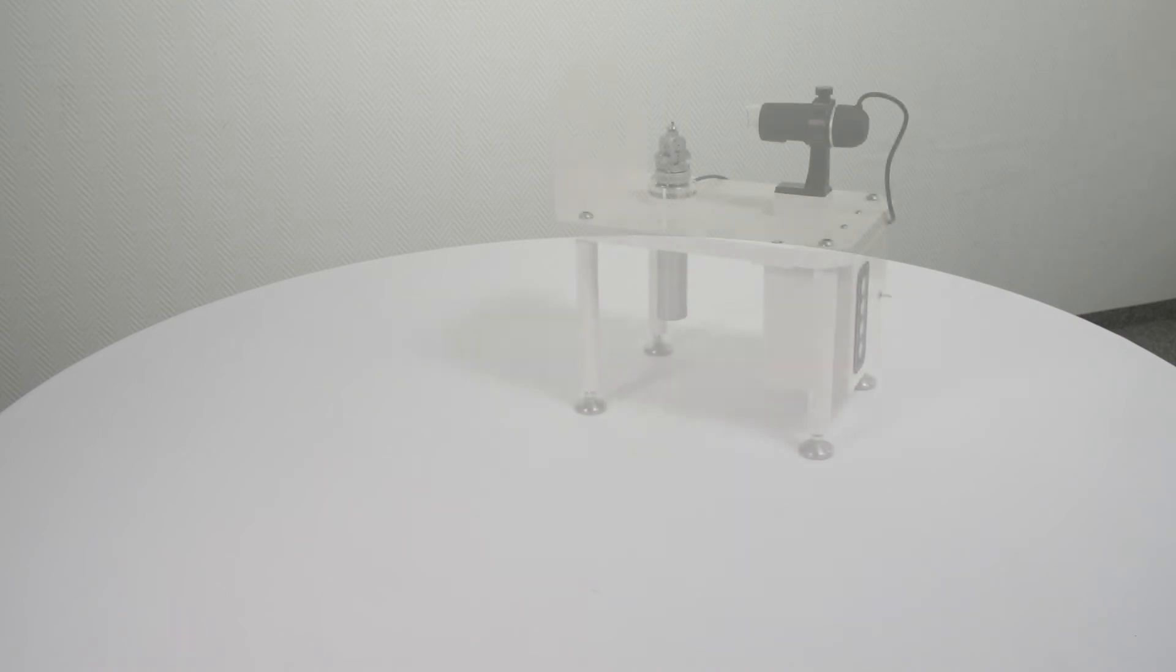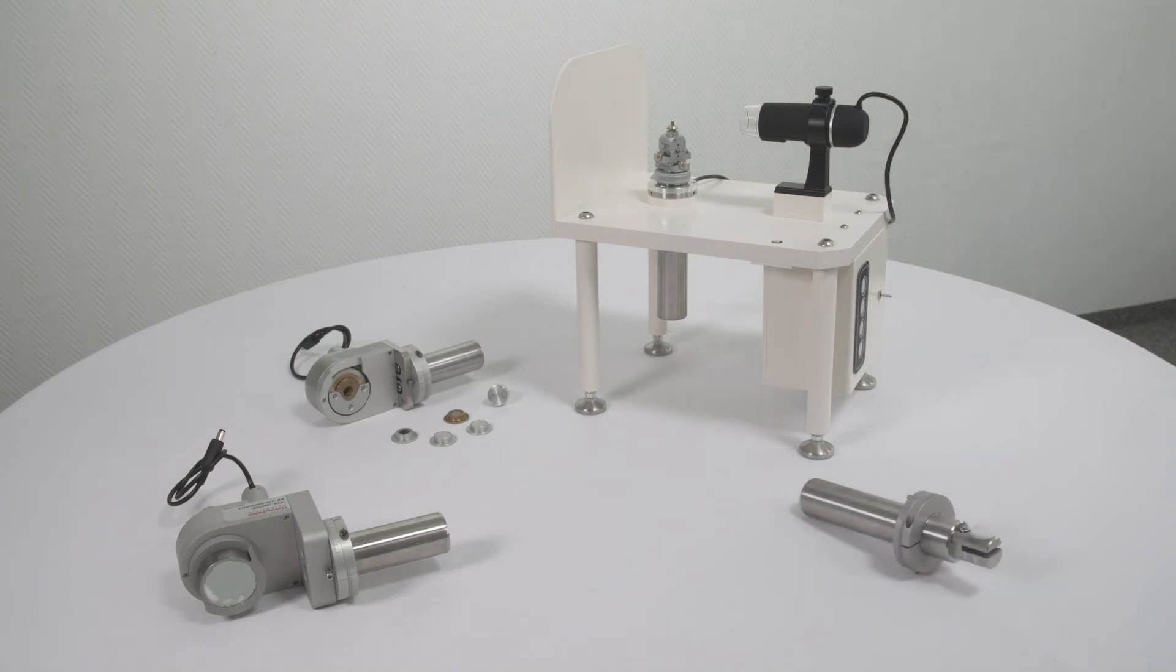The ARL Equinox XRD instruments can be equipped with sample stages for any type of sample, from powders to capillaries or bulk materials. There are no limitations.